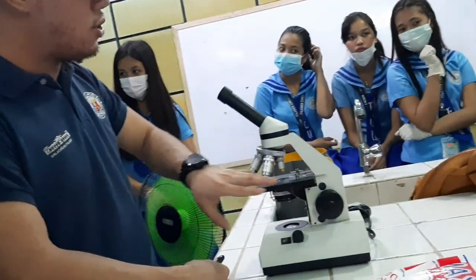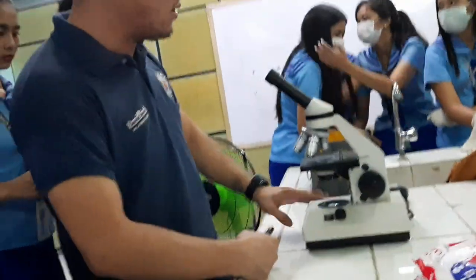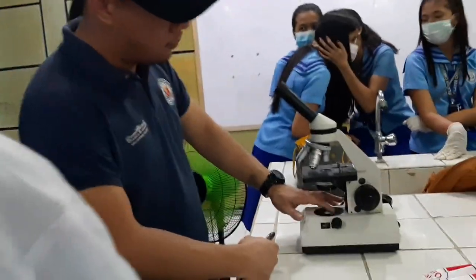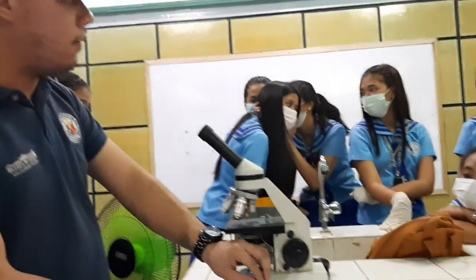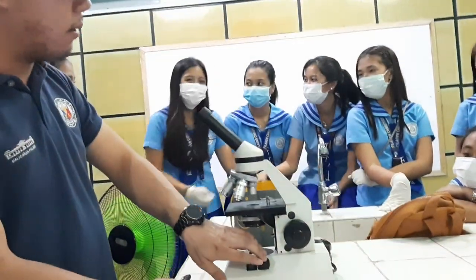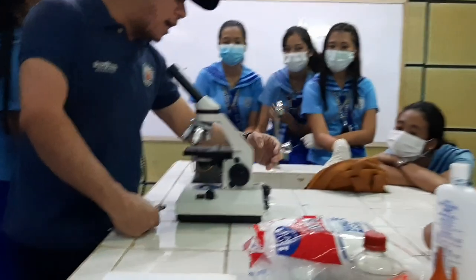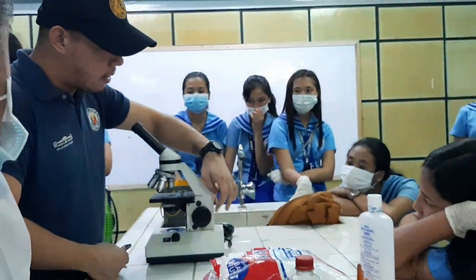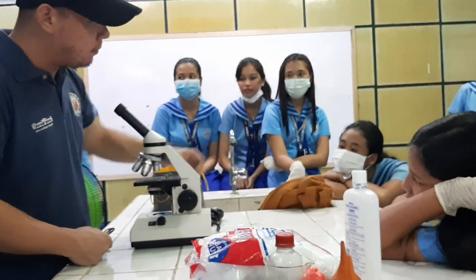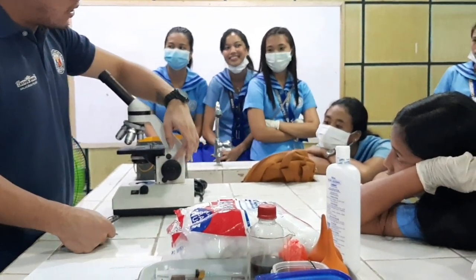Okay? The stage. This is the base. Wala naman na dahil problema. This is the base of the microscope. The bulb. Here, the power on and off. The fuse, ha? Kasi ang reading fuse, ha? So, hindi pa and this is the ano ni ganit sila? Ngayon, dua? Dako, pagkang gamay. This is the big circle, small circle.